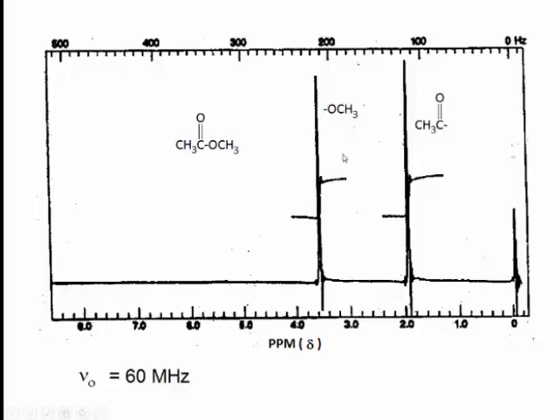After obtaining the spectrum, you put the instrument into what's called a peak integration mode. And in one approach, what the instrument, or the computer associated with the instrument, does is draw a stair-step line at each NMR signal. That's what we're seeing here. It turns out that the height of this stair-step line is proportional to the peak area.